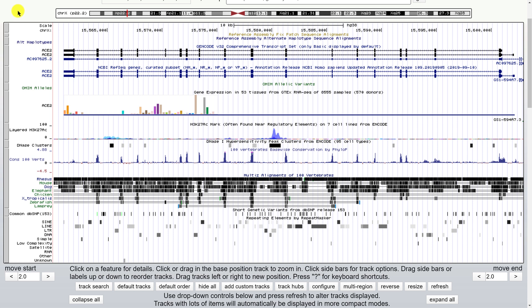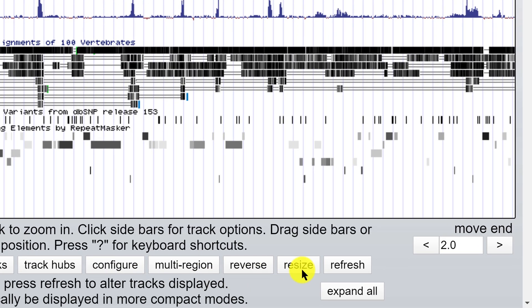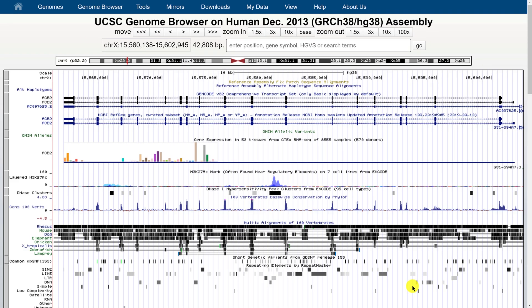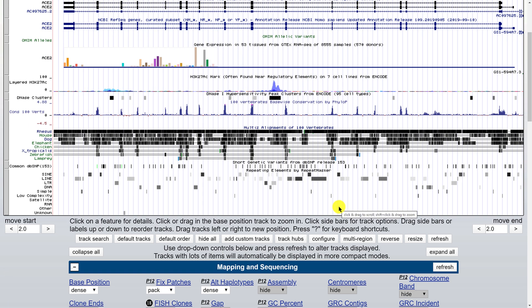One of the first things you can do is go below the content window where you've got a number of settings — click 'Resize' and let it refresh. What will happen is the browser will change the width of the browser window to fit your screen, so whether you're on a small laptop, mobile device, or a large 4K monitor, it will adjust the size automatically and you don't need to know the width of your screen.